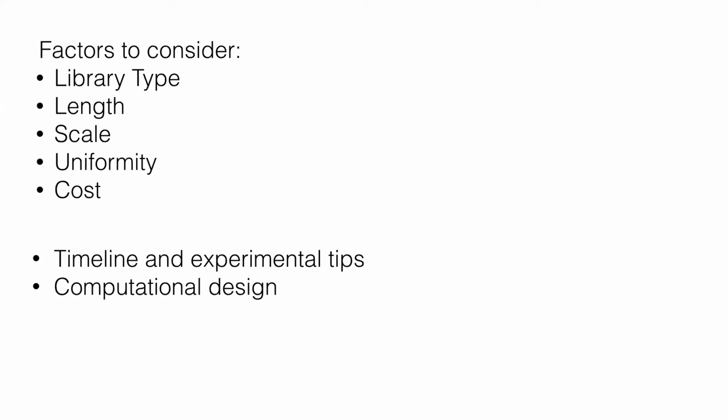And the cost of DropSynth is primarily a function of the cost of the underlying oligos you actually use to do the assembly. To give you a very rough estimate, it's just going to be the number of oligos you use in each gene times the cost for each oligo, plus a small factor of 10–20%.